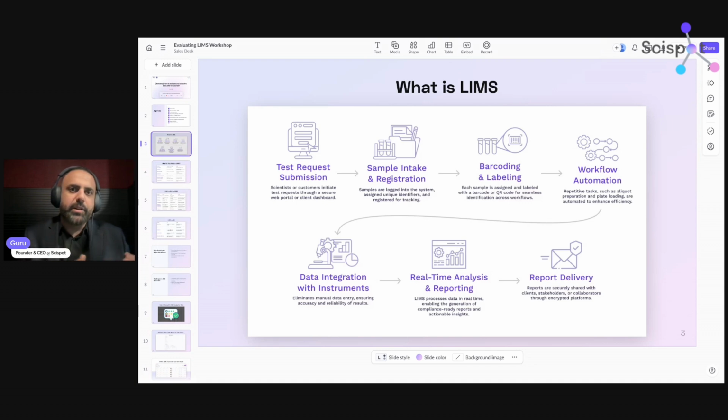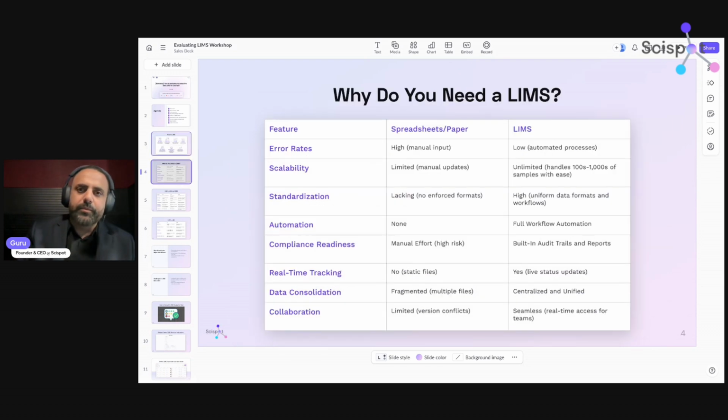They have teams designing compounds in silico, then in the lab, and then they need their high throughput screening team to screen those compounds. So that's a very sample heavy workflow. So in that case, they need a LIMS to process tens of thousands, if not millions of compounds smartly, because you cannot use spreadsheets for all of that.